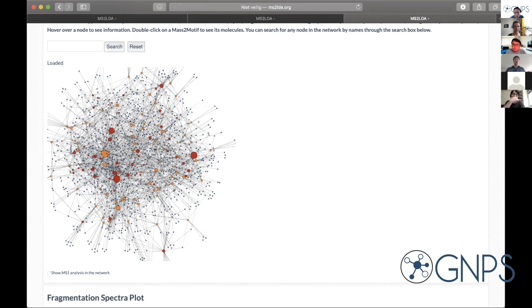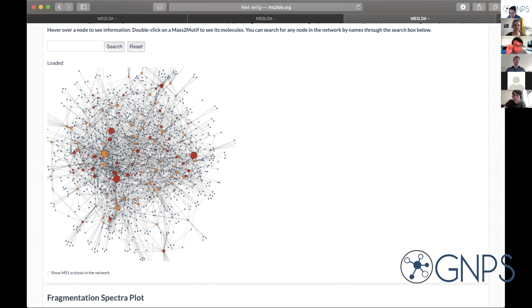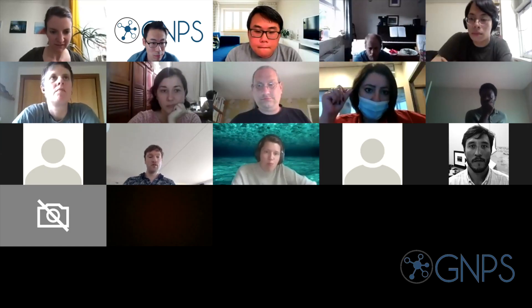Thanks for your attention. I will move over to Madeline to show you how you can combine the knowledge from MS2LDA with your molecular network and create a useful Cytoscape file using the MolNet Enhancer approach.